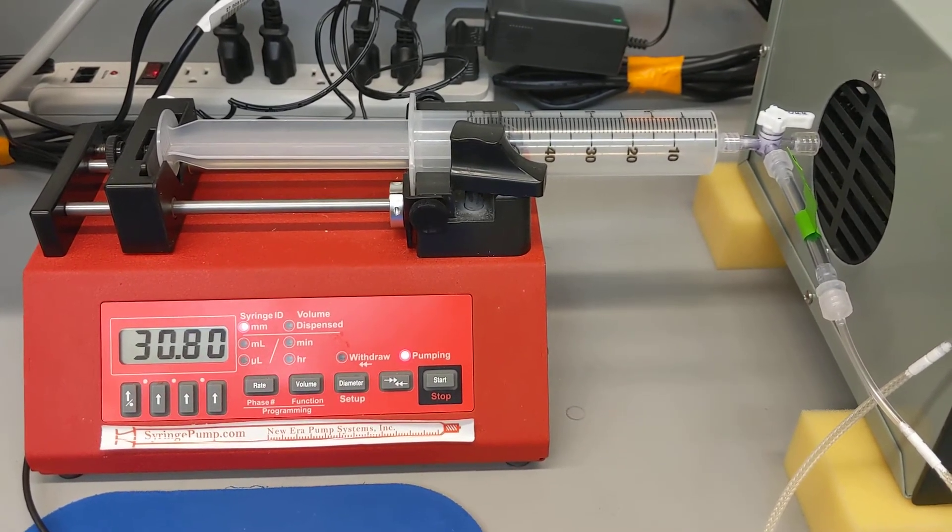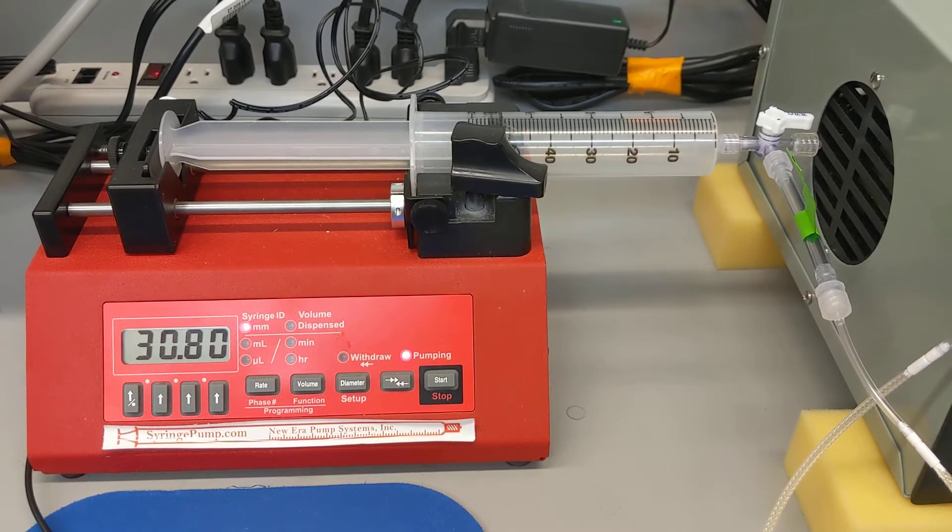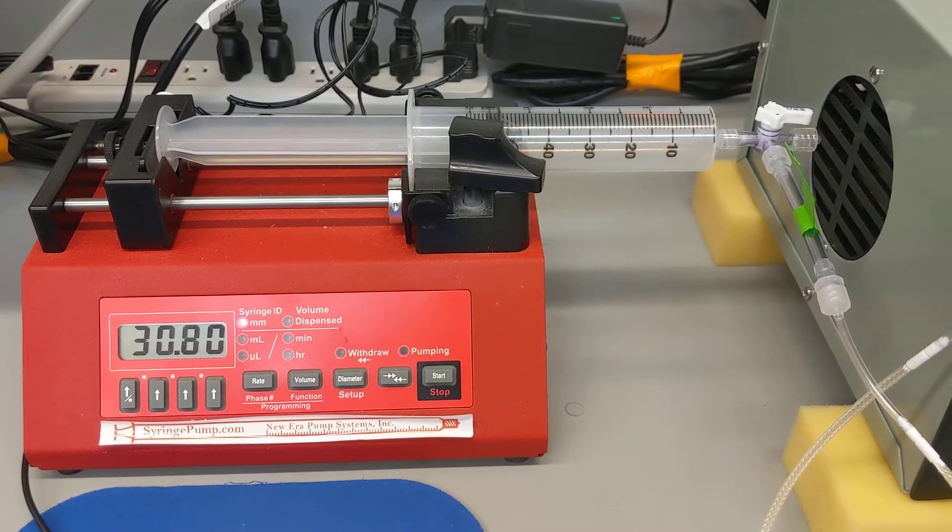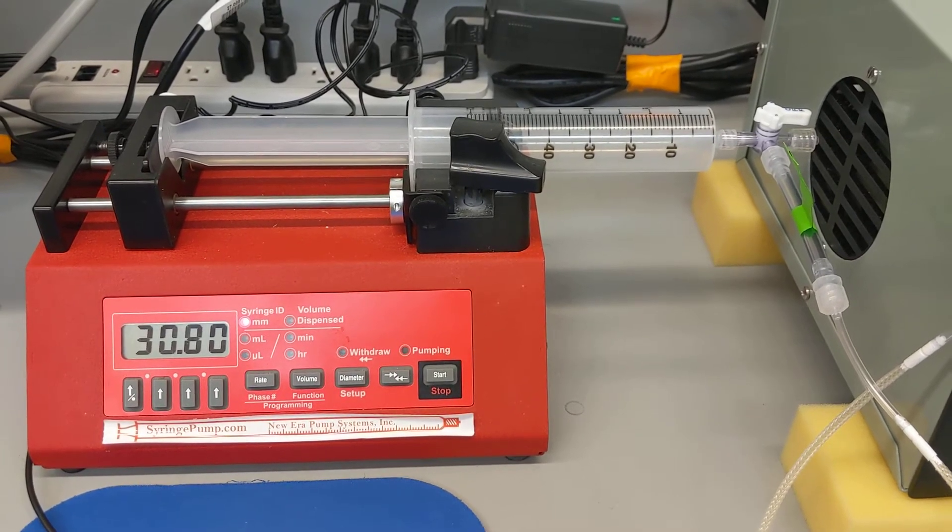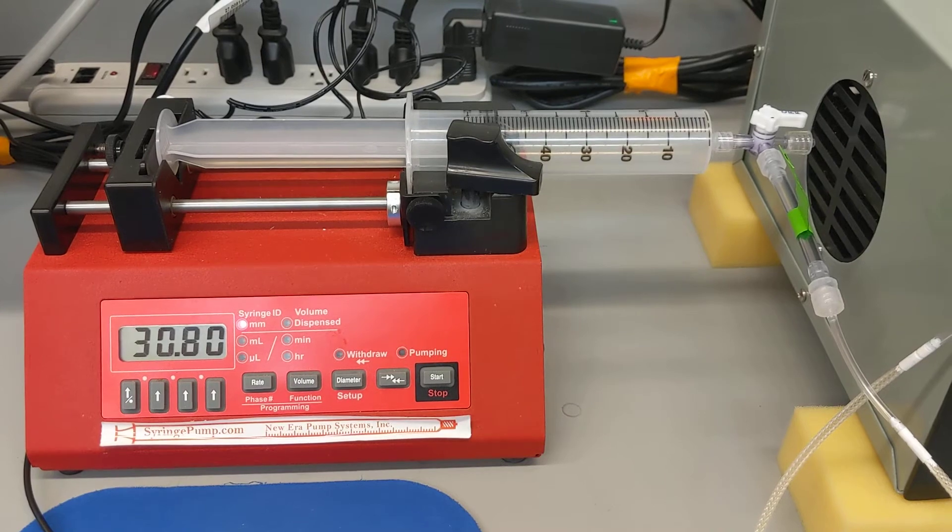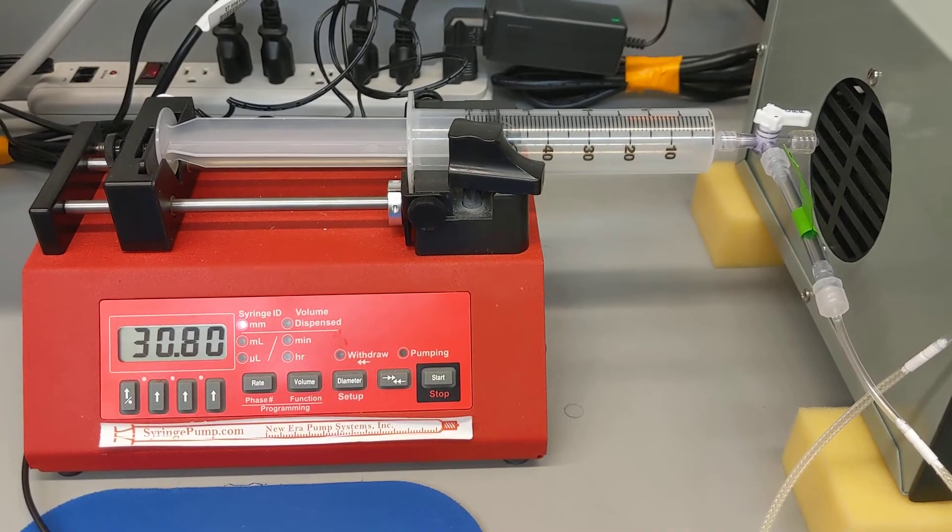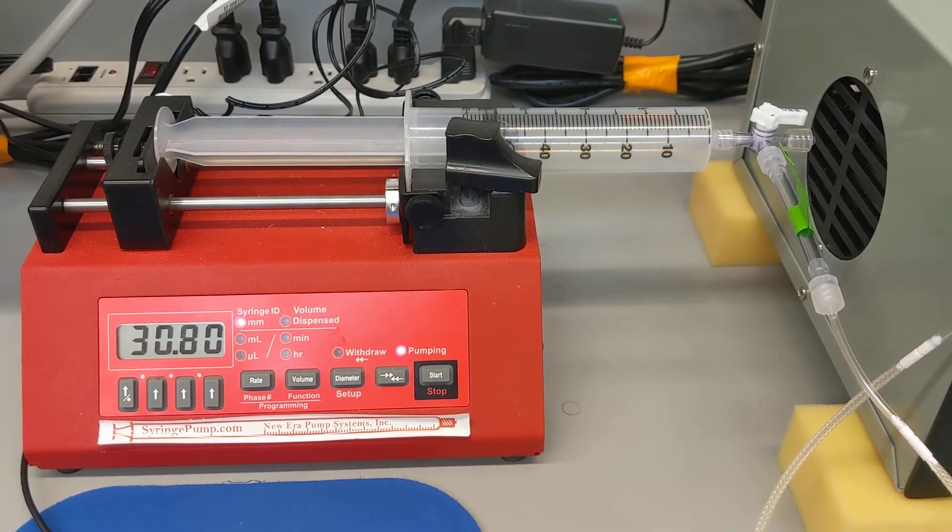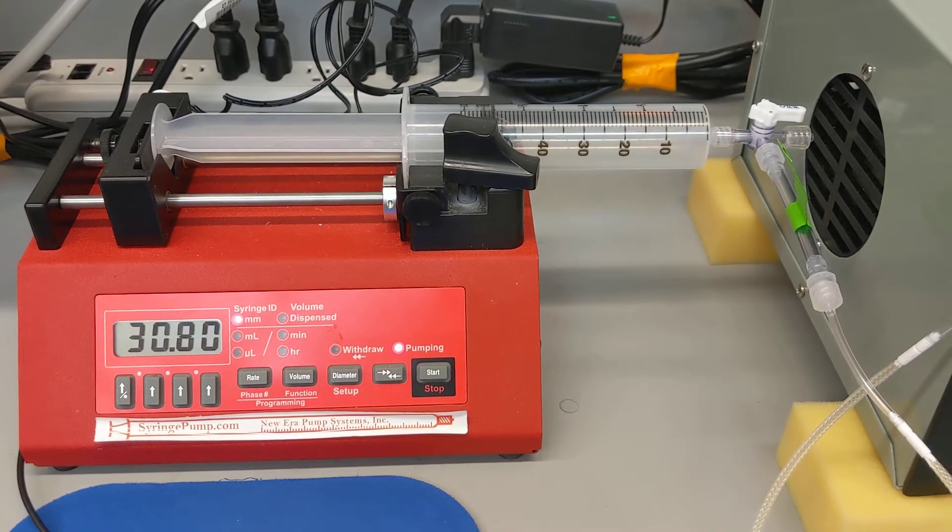So we need to control this. We can't just push it through with our hands because that could affect the percentage of oxygen as we change speeds pushing it through.